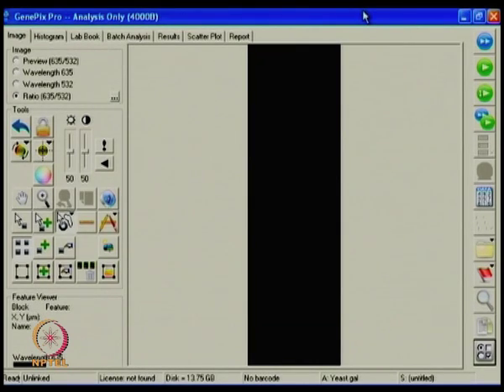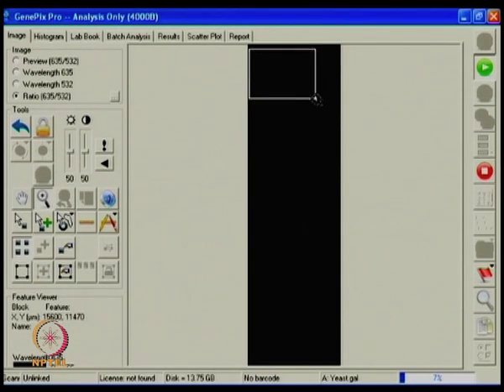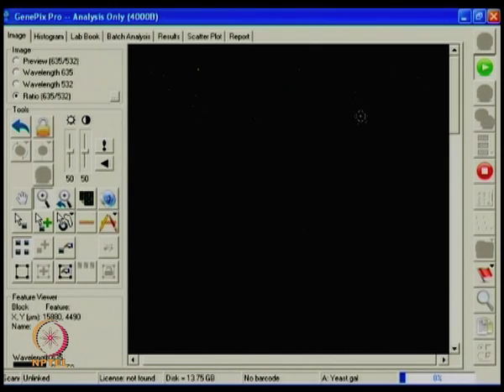Now let's quickly go through one particular scan, which is a simultaneous scan. So both lasers will be acquired at the same time. If I press the data scan button, after putting your inverted slides in the hardware, it is scanning. You just see on the top, which is very less visible. So let's try to zoom inside. If I just press this button, it allows you to zoom into a particular region and see how the scanning is happening. So you are looking at different image types.